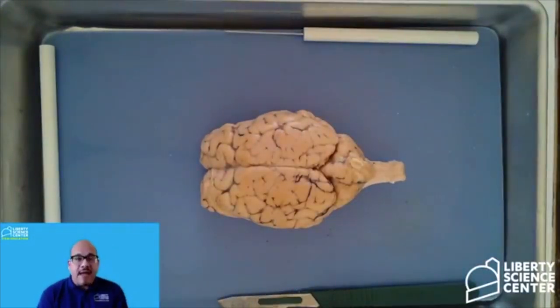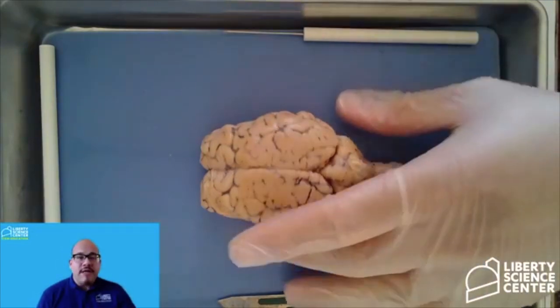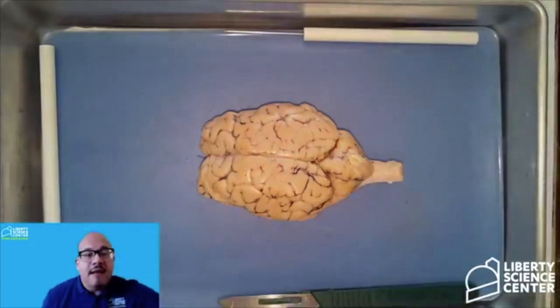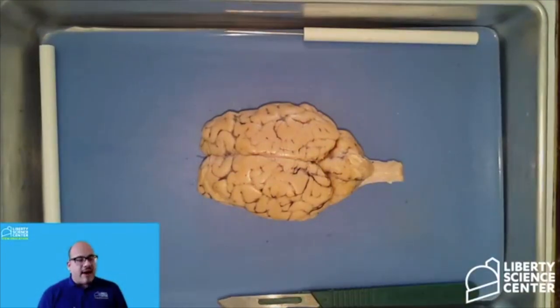So comparative anatomy, pretty self-explanatory, is where we are utilizing different types of species to understand what anatomical structures are similar throughout all living organisms, and how they differ depending on the organism that we are examining. With that being said, a lot that we are going to see with our dissection here has a lot of similar structures when it comes to the human brain. There are some differences here and there as we go through our dissection, okay? But I will point those out as we go along, okay?